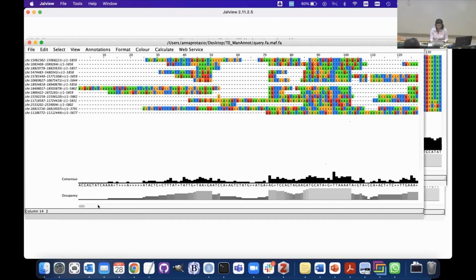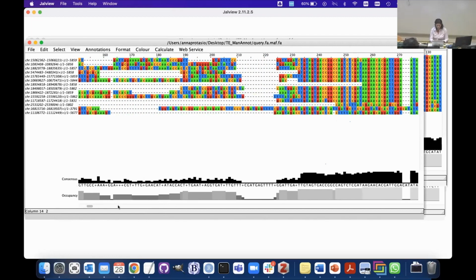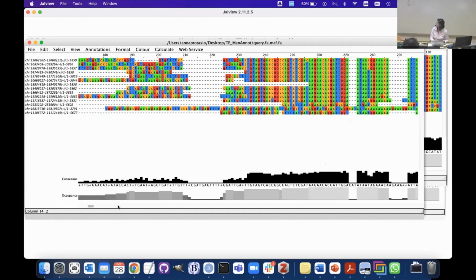And I know that because I've already done it, but I'm going to show that to you. So I can start walking. Oops, that's where it starts. I'll tell you a secret. There's a TG there. So that looks like the start of an LTR.